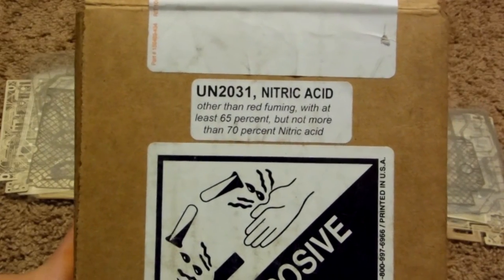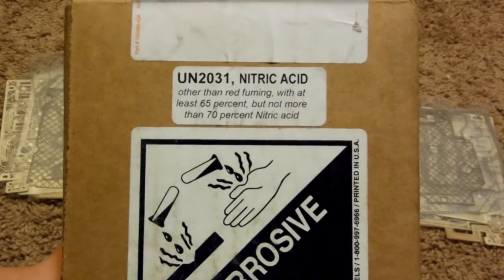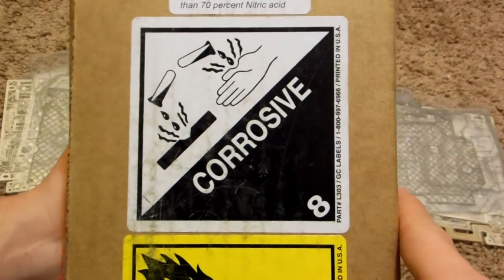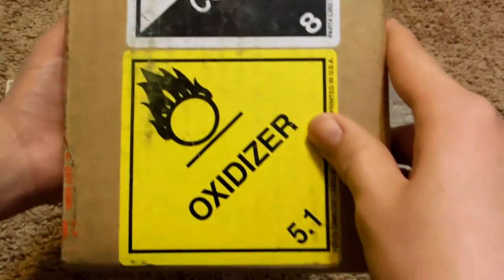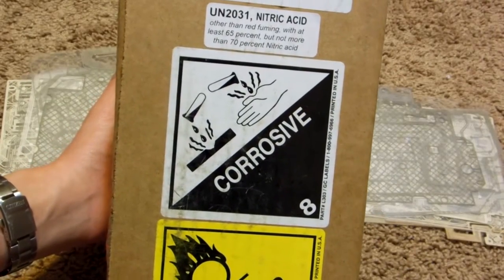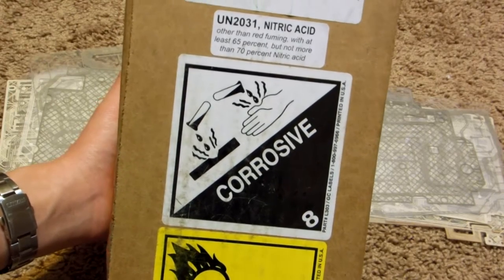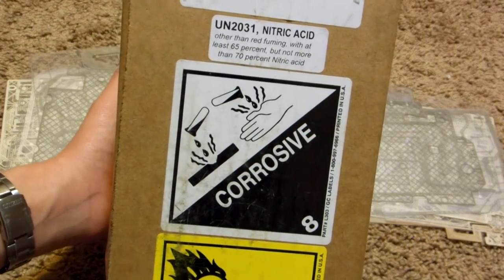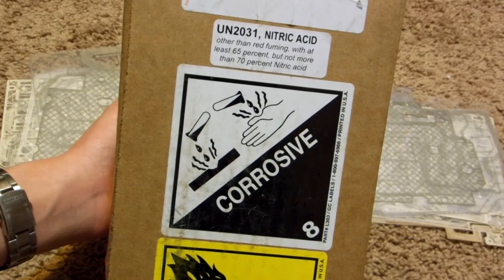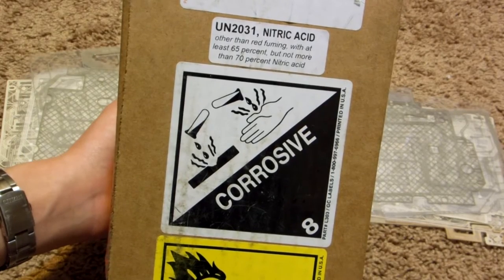I bought this acid off of Science Company, but as you can see there, it says other than red fuming, with at least 65%, but not more than 70% nitric acid. And I get some nice little sticker labels on here, like corrosive and oxidizer. So be aware that you may encounter some of these issues depending on your situation, but this corrosive warning obviously tells you to be careful when dealing with this kind of acid.